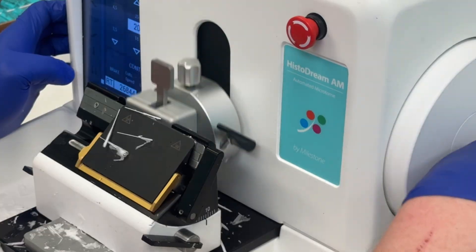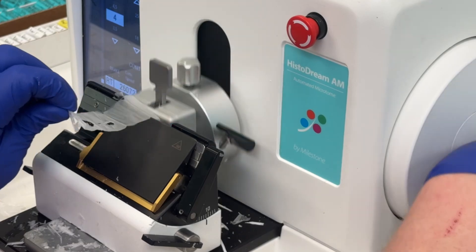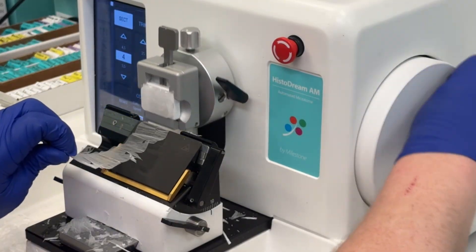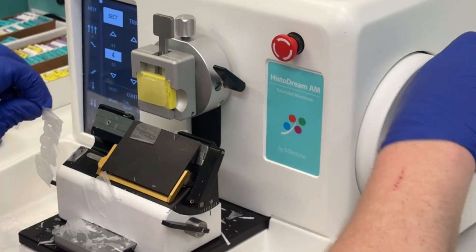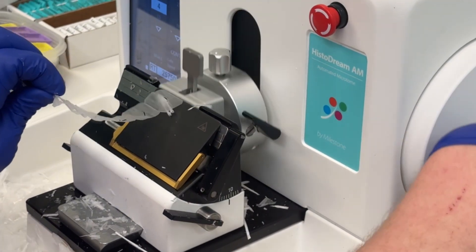Finally, it was time to cut and compare how each method performed. Here's what we found: no treatment produced a decent section at microtomy. EDTA decal before processing did not show noticeable improvement in cutting. Lotion applied after facing cut better than both untreated and decal samples. And Nair applied after facing cut the best overall.